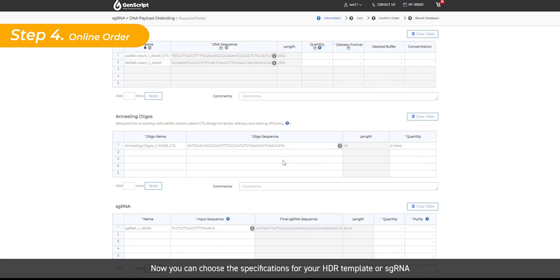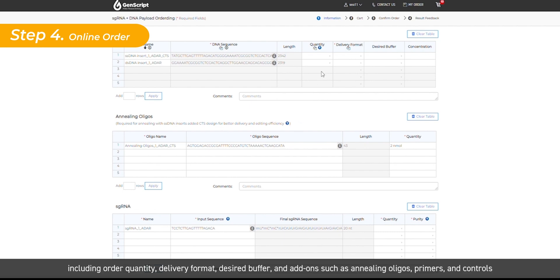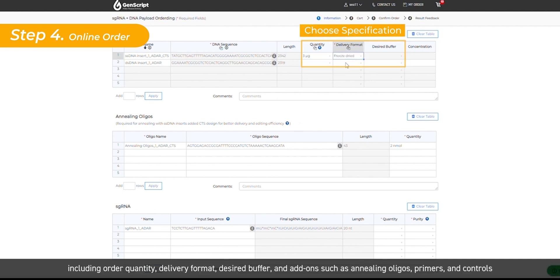Now you can choose the specifications for your HDR template or sgRNA. You will be presented with various options including order quantity, delivery format, desired buffer, and add-ons such as annealing oligos, primers, and controls.